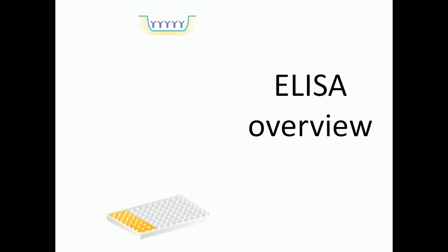If you look from the longitudinal section, you can see this. These wells are coated with specific types of antibodies. Let's say these are the antibodies, the Y-shaped structures. They are attached to the well bottom. So at the bottom of the well, all these antibodies are attached and their FAB portions are free to react.